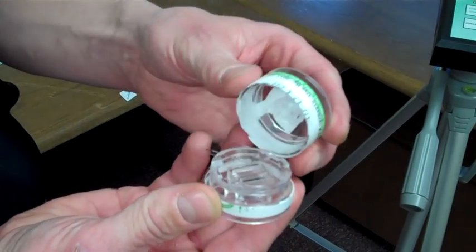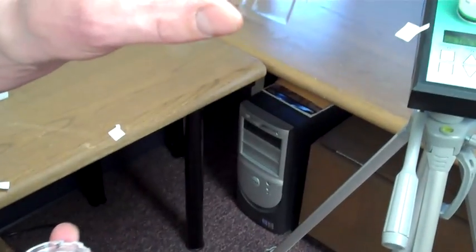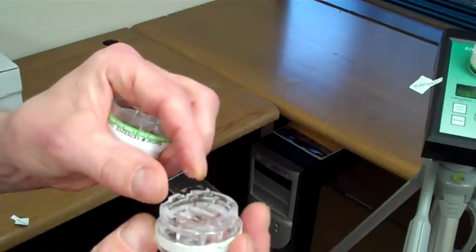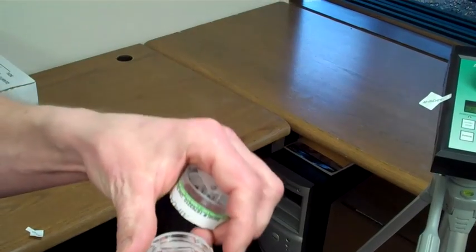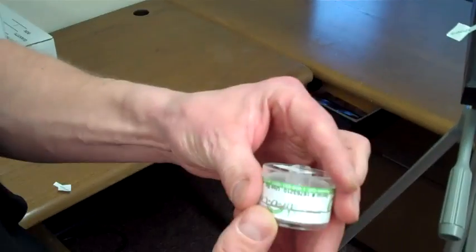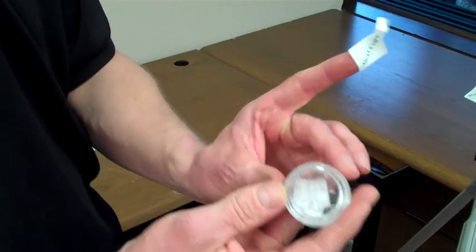Now he's going to pull that apart and inside you can see a slide. This slide has an adhesive on it that collects any particulate within the air including mold spores. This slide is what will later be analyzed in a laboratory.